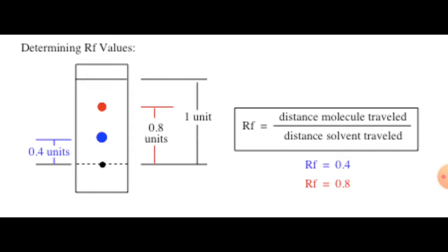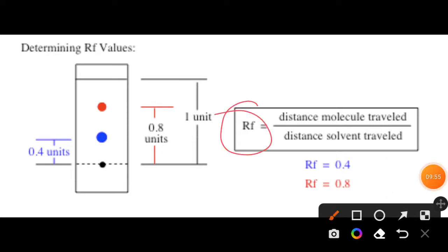Suppose an organic molecule, suppose a mixture of protein, you can't make out whether it is a protein or not. So with the help of the chromatographic technique you can find out whether it is your desired protein sample or not, if you know the RF value of your desired product. Then just by performing the separation, you can easily calculate the RF value, right?